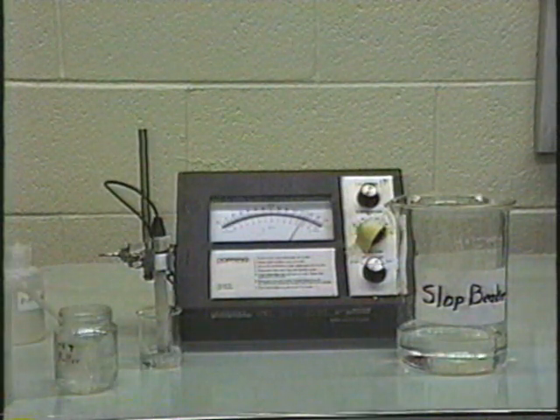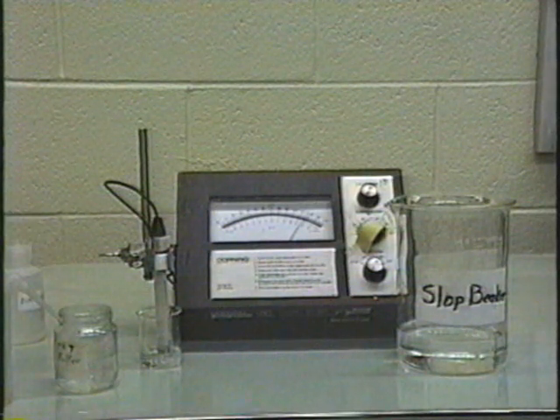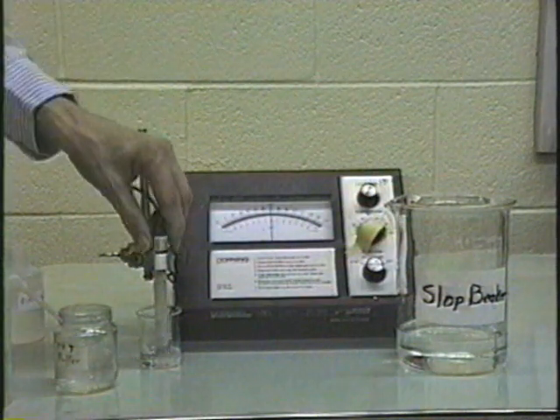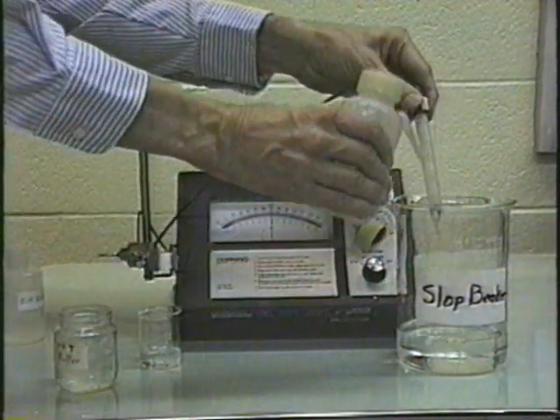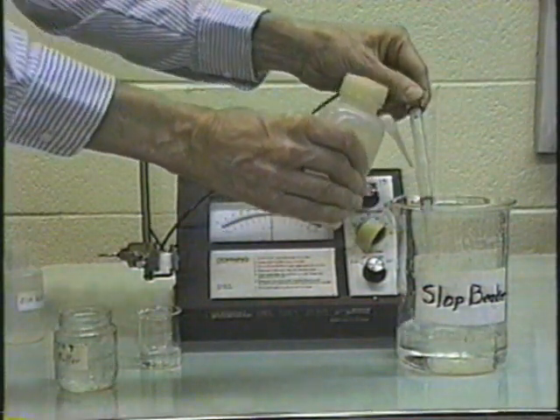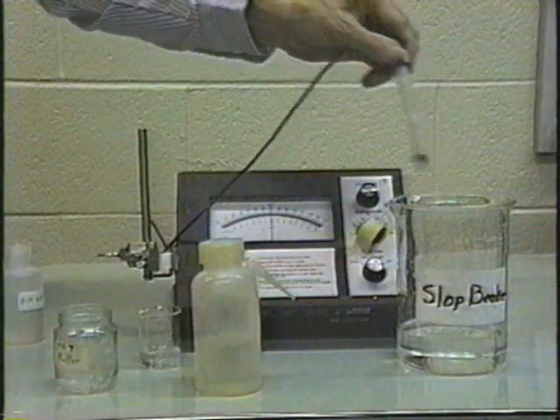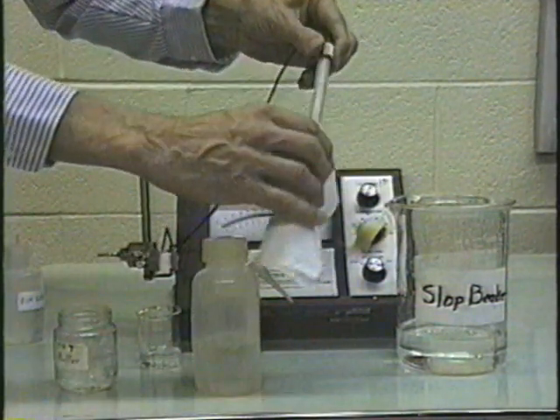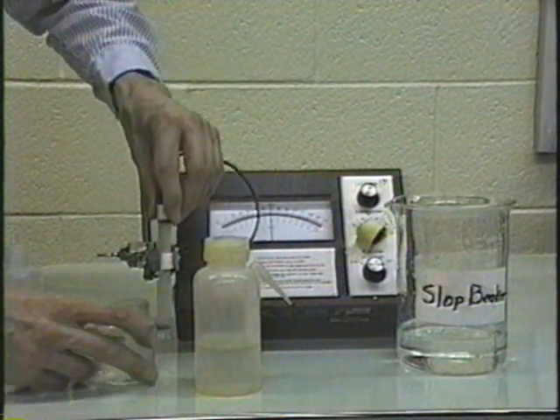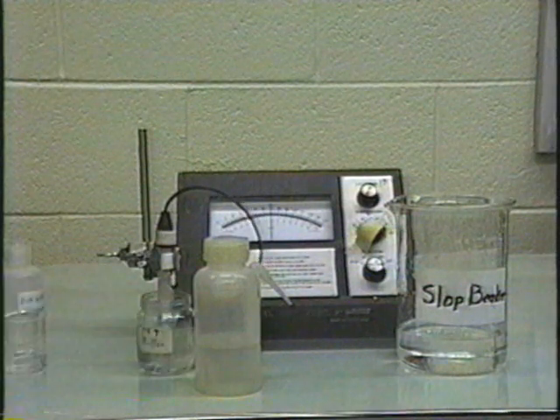However, when we are through making measurements with this solution and want to change the solution, what we must do is put this to standby, take the electrode, clean off the electrode, blot the electrode clean, and then put our other solution, or if we're through, we'll just put it in the pH 7 buffer.